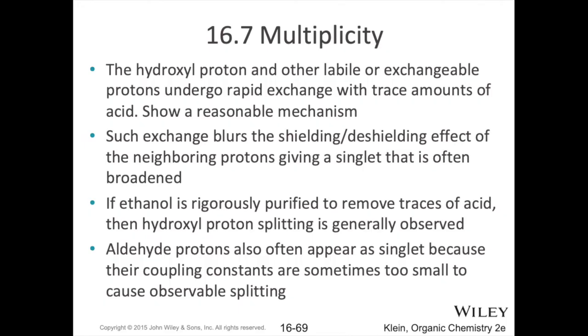Basically, we label these types of hydrogens as labile, meaning that they can come off of the molecule relatively easily in the presence of an acid, especially. Due to this exchange of protons, the ease at which these protons are plucked off, they don't really behave like normal protons that are there all the time. And so we don't see these coupling effects, those splitting effects that we would typically see. Oftentimes you'll see a broad singlet for an alcohol group like that.